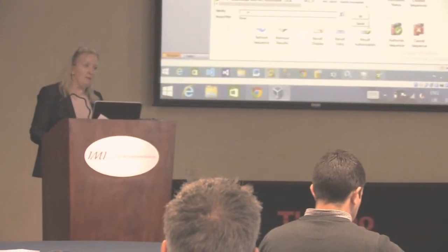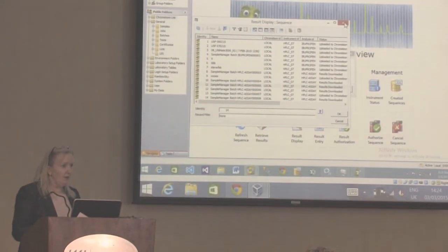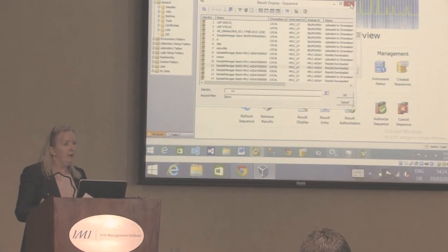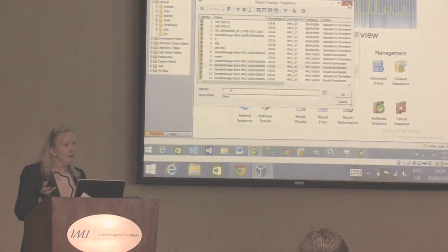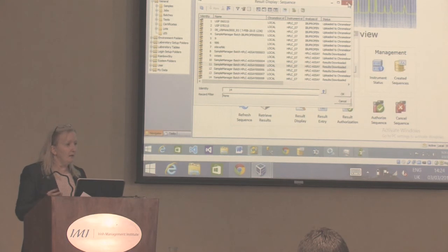Well, your specifications are just your SampleManager specifications. So for your results, you have your specifications within SampleManager, so you do all your spec checking as normal. For your selections for instruments or for the amounts as you're entering them, if you want to do checking there, then that's set with criteria.